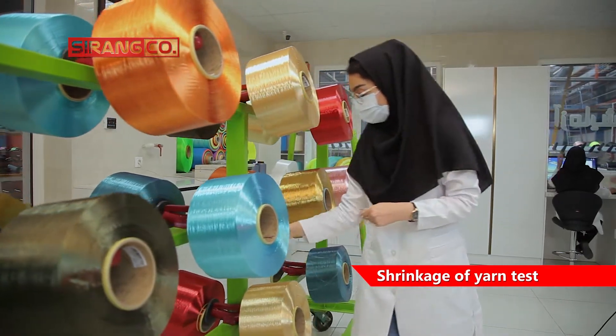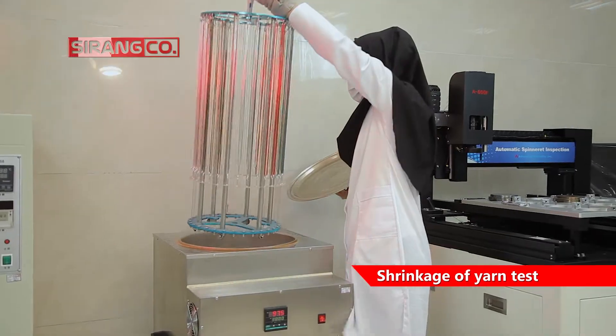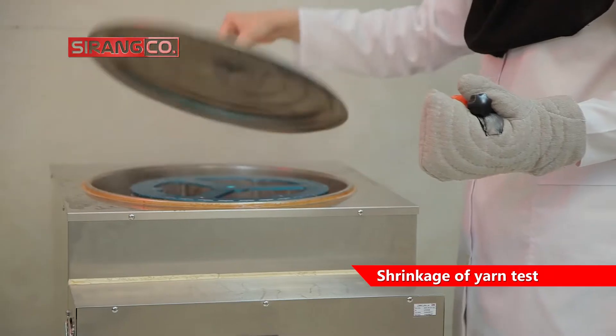Yarn shrinkage can be applied, measured, and reported in a variety of conditions including boiling water, hot and dry air, saturated steam, or even superheated steam.